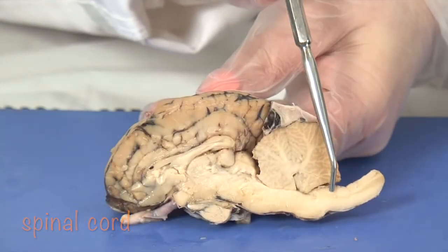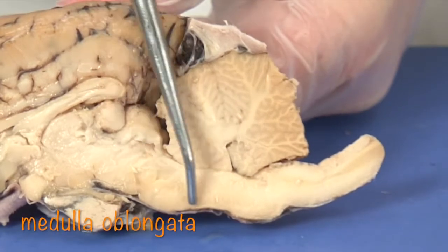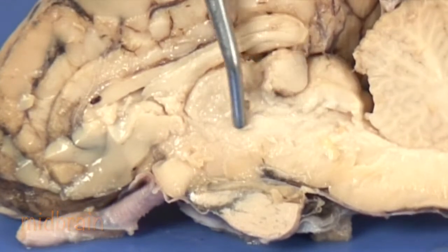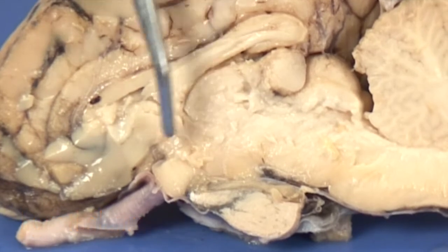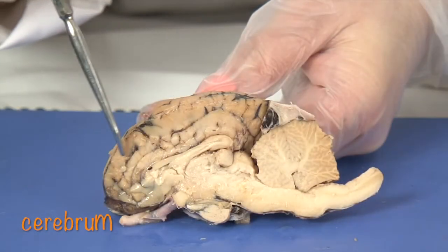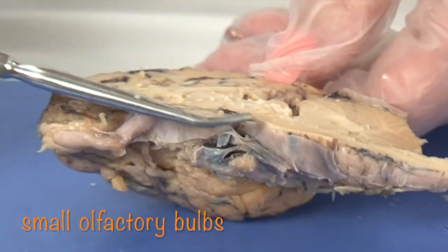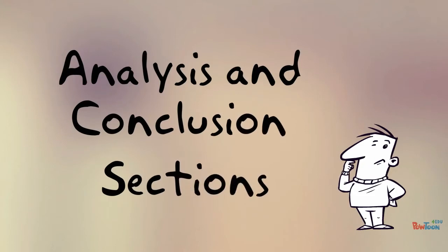Identify spinal cord, cerebellum, medulla oblongata, pons, midbrain, thalamus, hypothalamus, pituitary gland, corpus callosum, cerebrum, small olfactory bulbs. Complete any remaining steps of your lab and answer the analysis and conclusion questions.